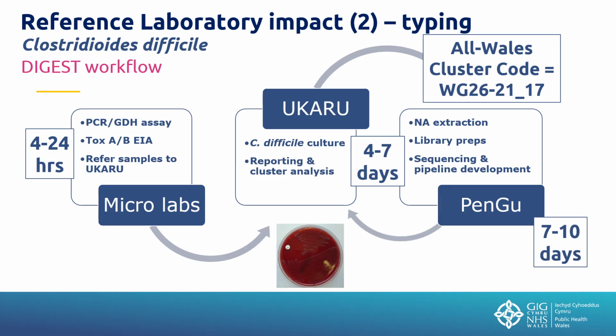The majority of them are actually sequenced and resulted within a week. So that's a huge impact within our reference laboratory.